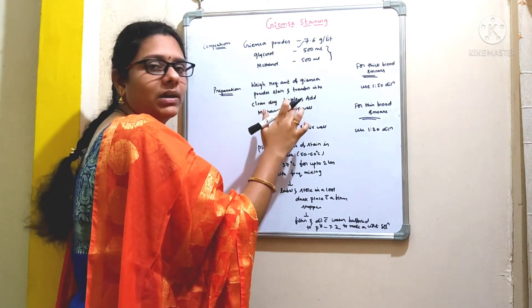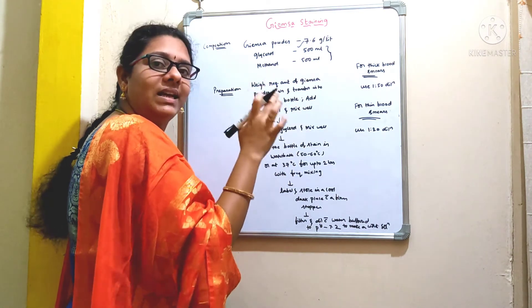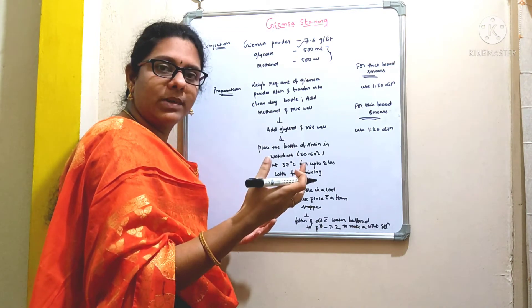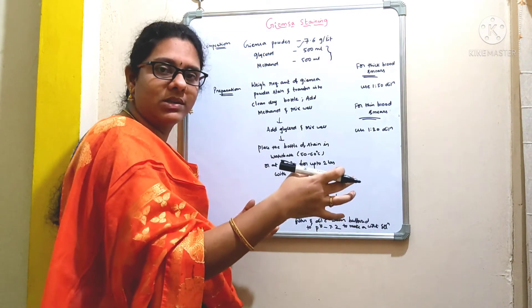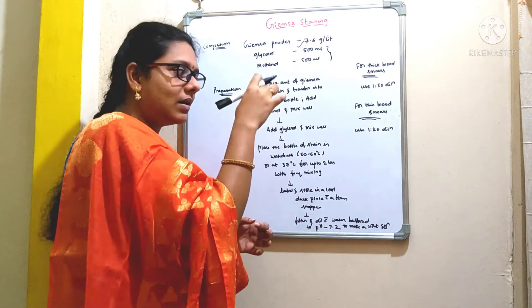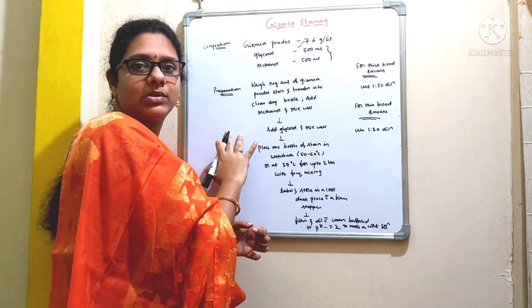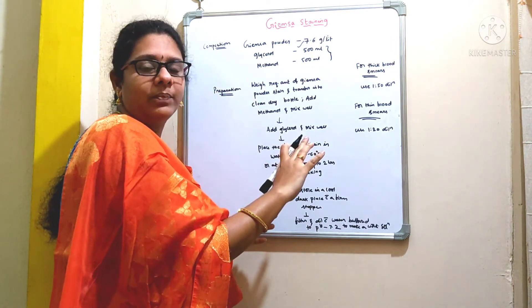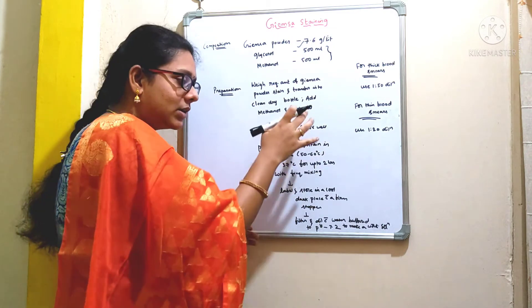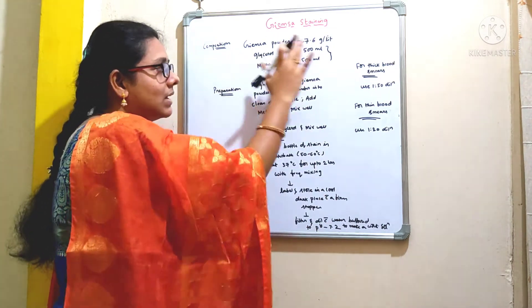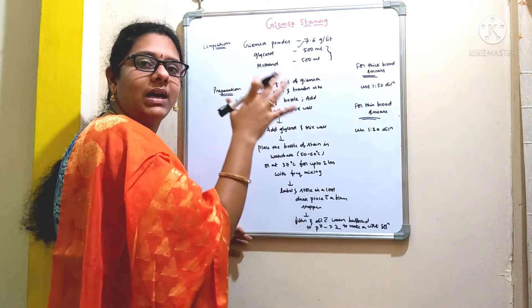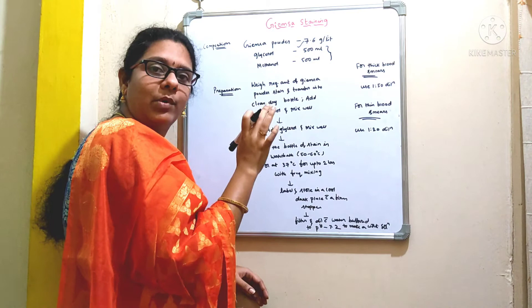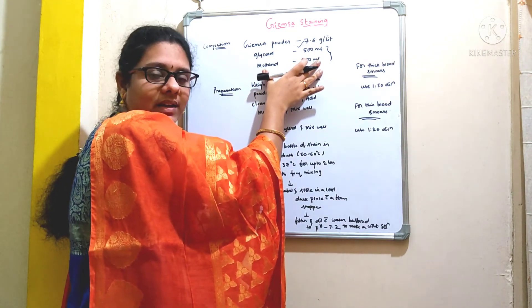First, weigh 7.6 grams of Giemsa powder and add it to a clean dry bottle. Make sure you use a clean dry bottle only — if any water drops are left in the bottle, that will contaminate the entire procedure. In any step, make sure there is no presence of water; if water contaminates the preparation at any step, it is going to spoil the dye.